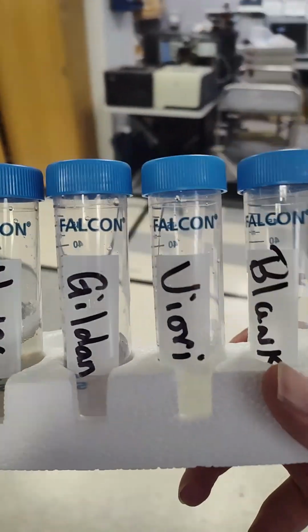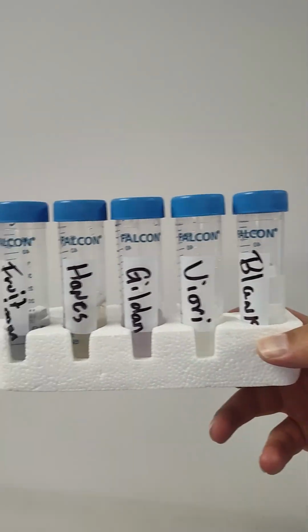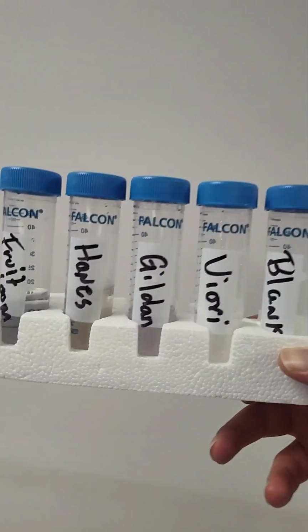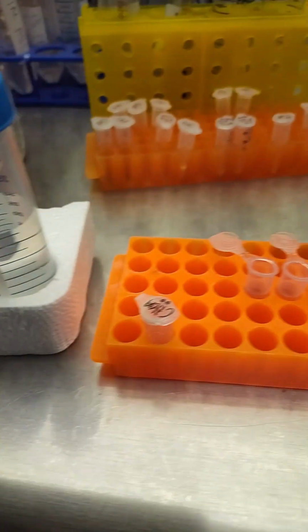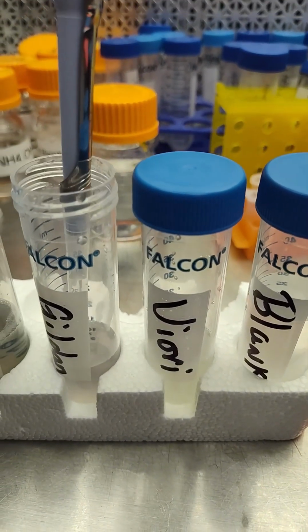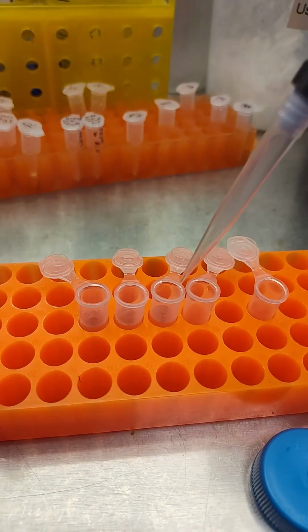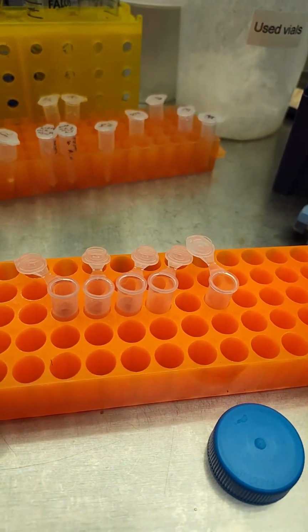Alright, and there we are. You can see that there is color in all of them. And so we got all the samples. Now we're going to centrifuge these out and run them on that Q-TOF over there. We're not doing much in this step. We're just taking 1 mil with my pipette and transferring it from the water directly, with no dilution, into an Eppendorf tube. Easy breezy.